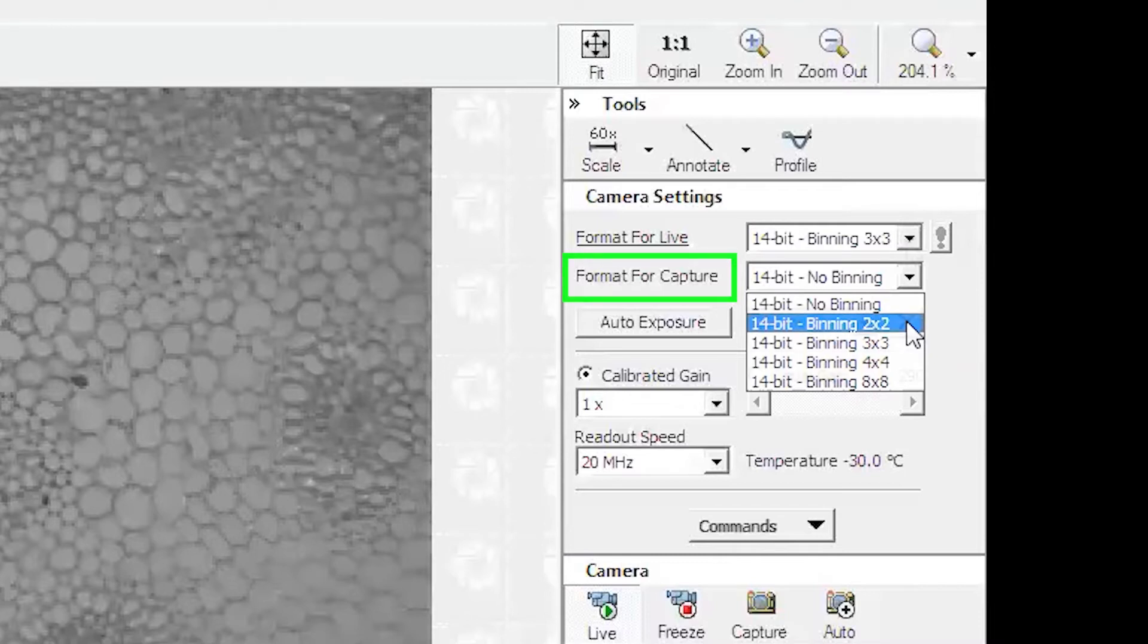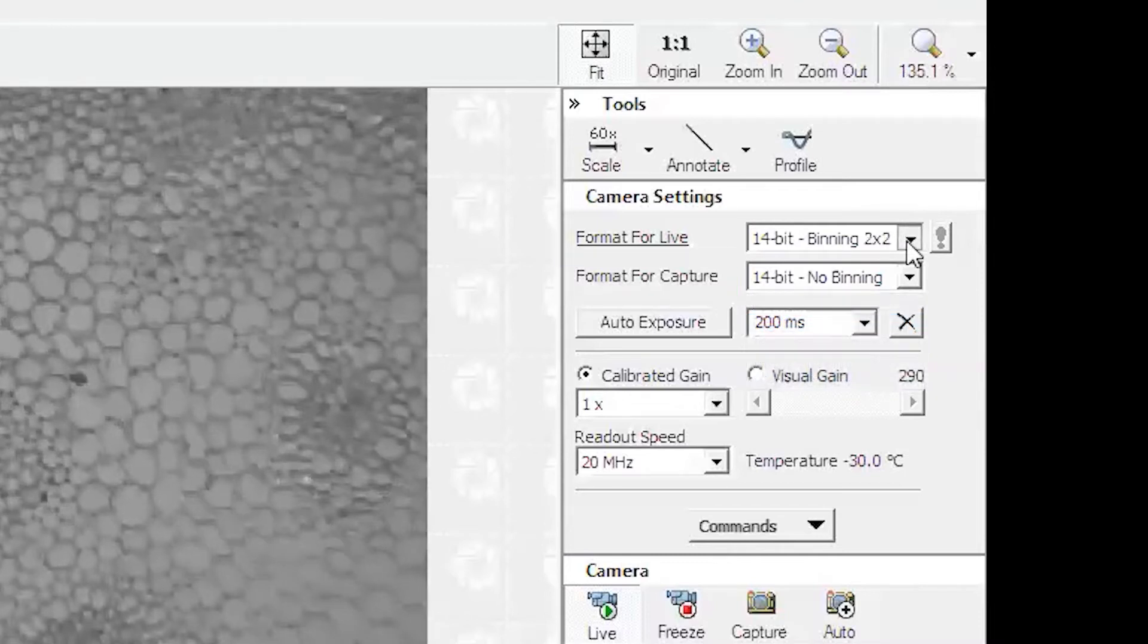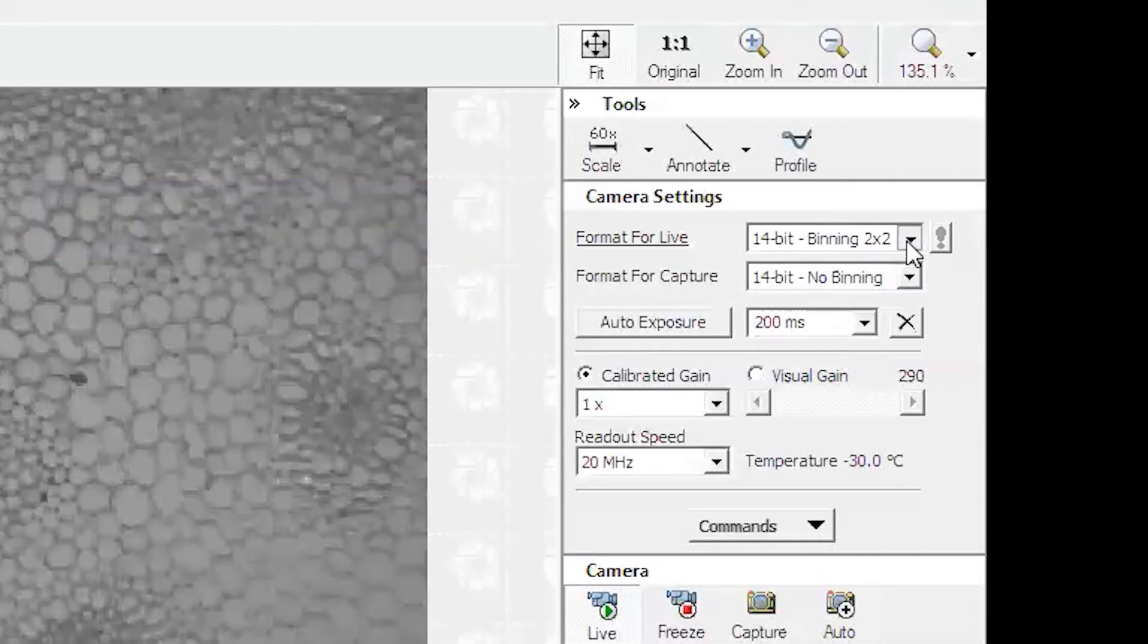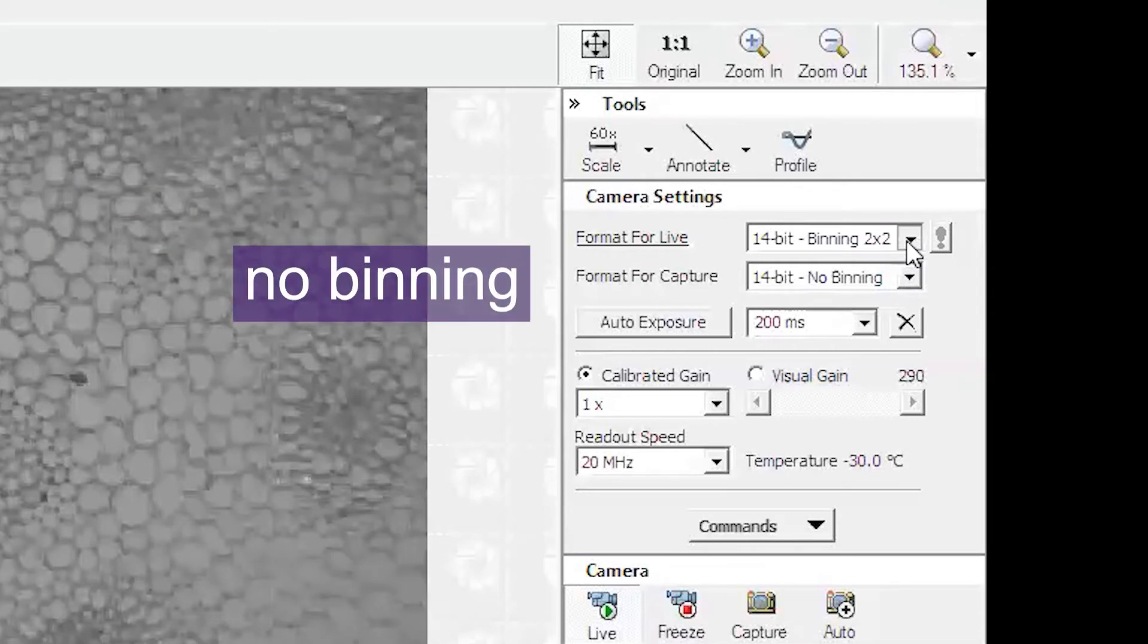For live imaging we suggest using 2x2 or 3x3 binning, whereas for capture for saving we suggest no binning to get the best resolution imaging for transmitted light imaging.